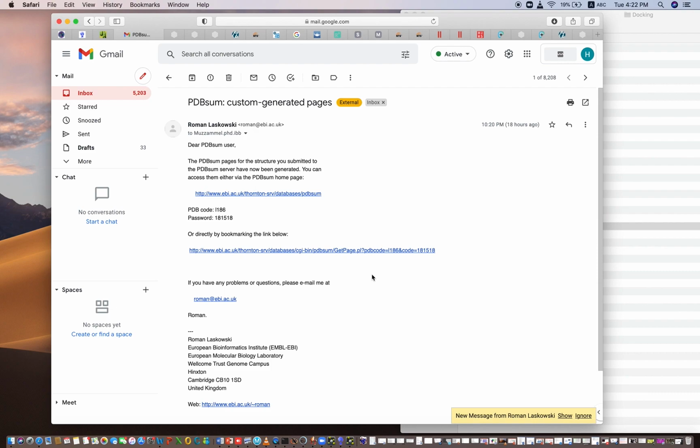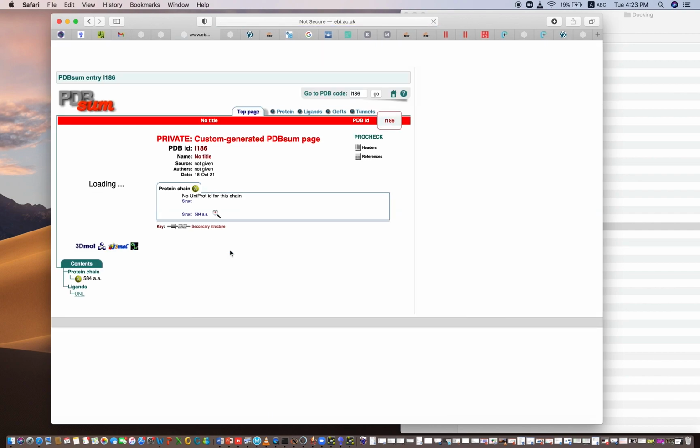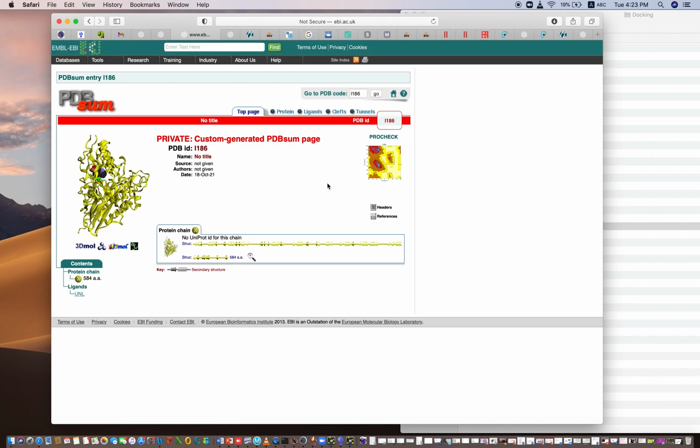It may take 2 minutes, 3 minutes, 5 minutes, 10 minutes, or whatever. This is the email which I received from PDBsum, and there is the PDB code and the password, or the link. By clicking on the link, I can directly go to the results.